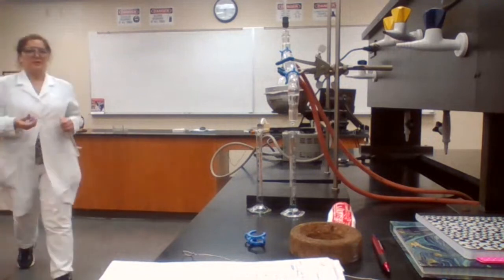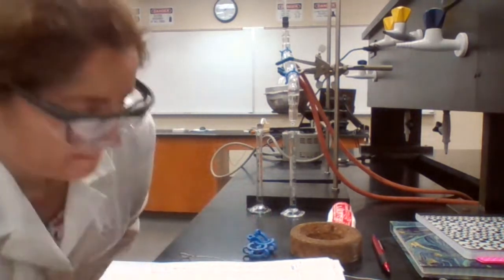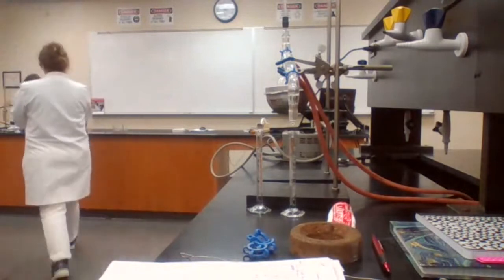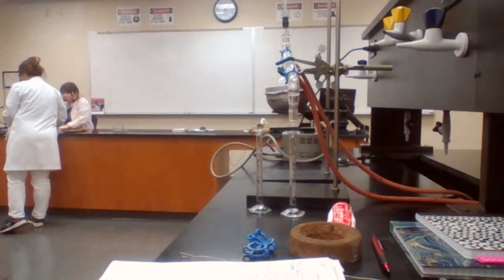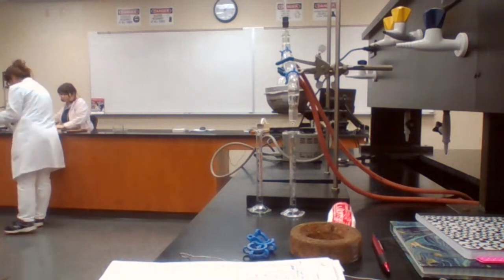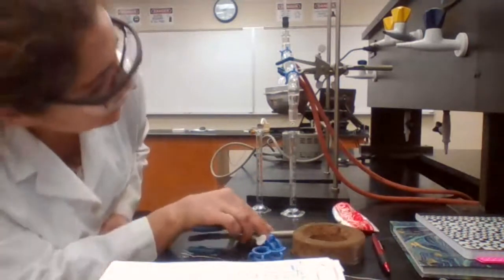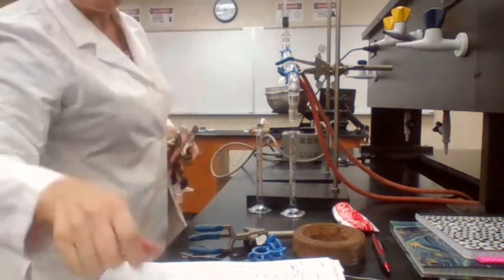It's slowing down because we are kind of running out. Okay. 15 milliliters, 78.